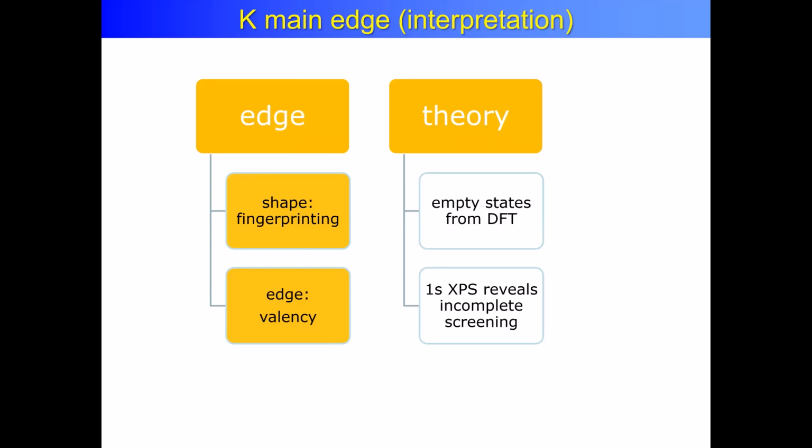Frank, this is TK Sham. I have a question for you. I just typed it out. I was wondering if anyone has done any XPS with the excitation energy very close to the threshold, so you may get satellites. Yes. I did not touch upon that issue. The XPS spectra I showed and we measured are excited at least 100 electron volts above the edge.